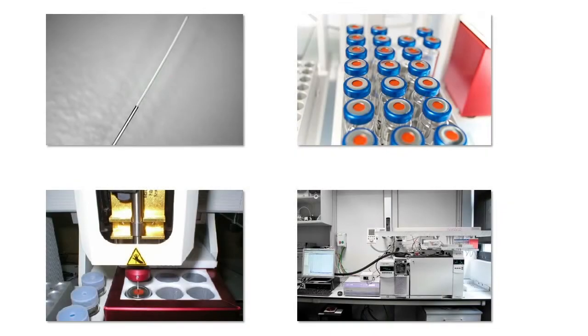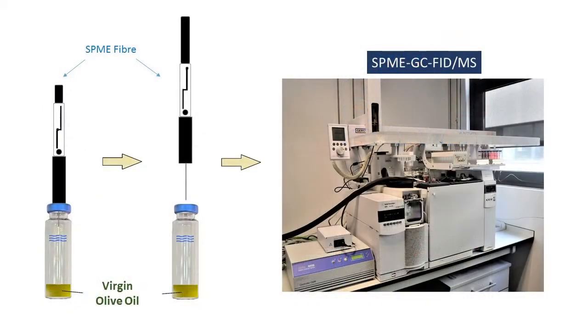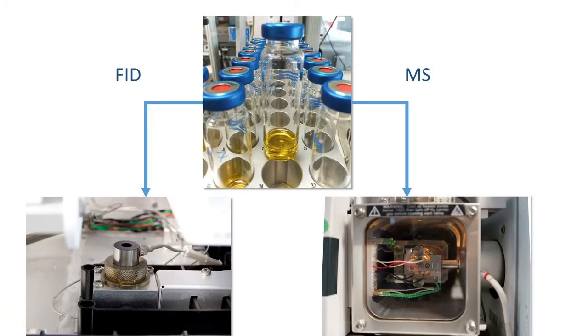This method is based on the isolation and preconcentration of volatiles by solid phase microextraction, SPME, and subsequent separation of analytes by gas chromatography and quantification with a flame ionization detector, FID. In consequence, the two options of detector are available.